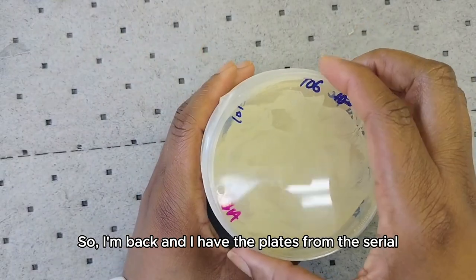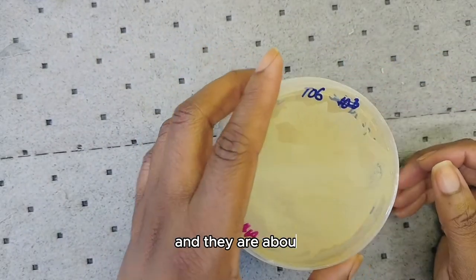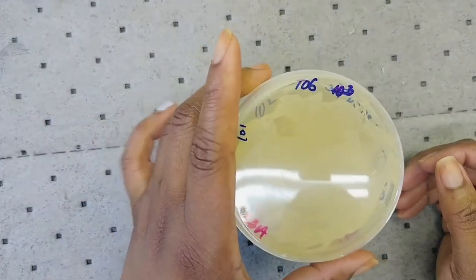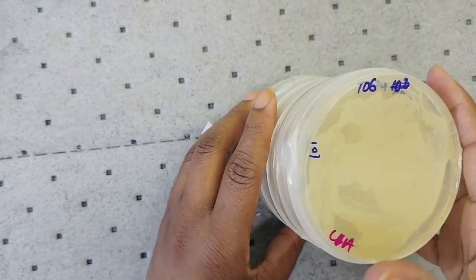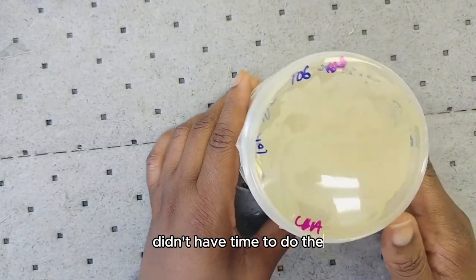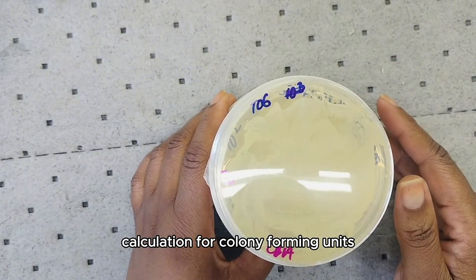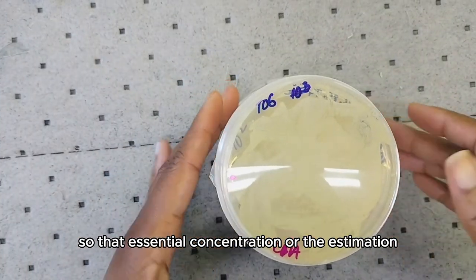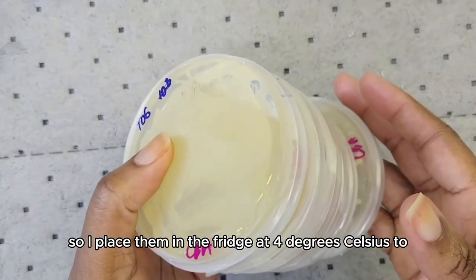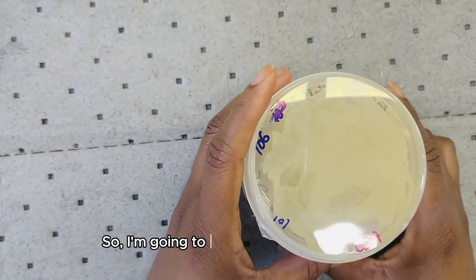I'm back and I have the plates from the serial dilution and plating — they are about five days old. I looked at them on Friday but didn't have time to do the calculation for the colony forming units, which is the concentration or estimation. So I placed them in the fridge at 4 degrees Celsius to slow down the growth of the microbes. I'm going to show you what the serial dilution resulted in.